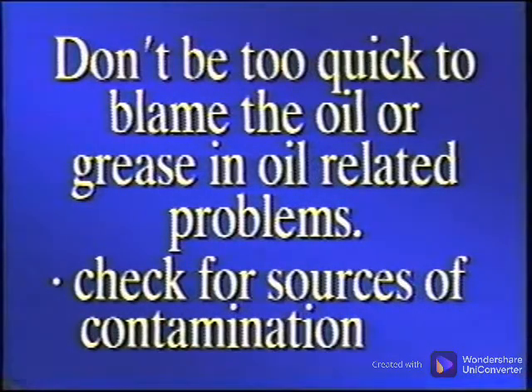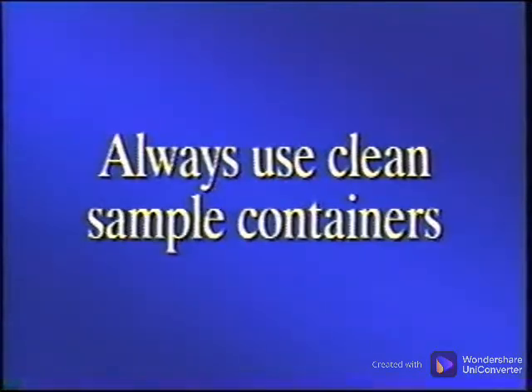Do not be too quick to blame the oil or grease in an oil-related problem. Look for outside sources of contamination and adverse operating conditions. Always use clean sample containers. Resample to ensure a representative sample. These troubleshooting tips seem obvious, but are sometimes automatically ruled out because they're obscured by the pressures of providing a fix to the current problem.